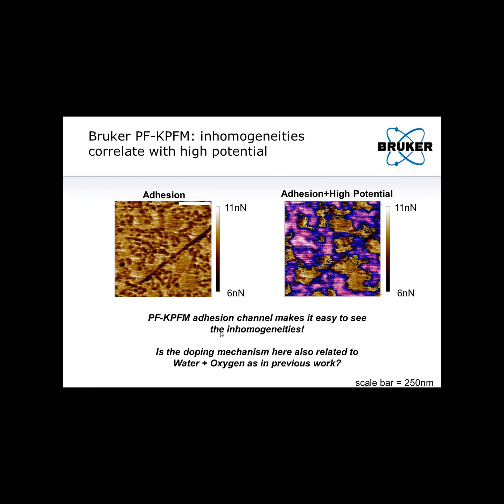So as far as instrumentation goes, this definitely demonstrates that having this additional channel is key to doing a correlation like this. It's very nice to just completely flatten the image, essentially, by looking at the adhesion channel, and you can just immediately tell where your different materials are.